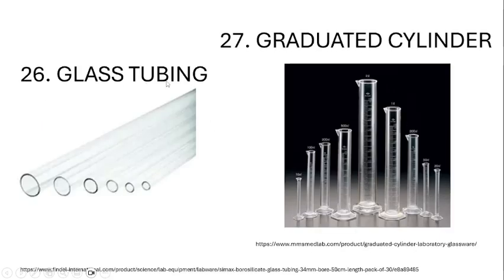Next is your glass tubing. So this is actually a long tube, but it can be cut in pieces or in segments according to usage. Usually, the ones who use the glass tubing the most are pharmacy students. So they have an experiment in the lab which is glass bending or glass manipulation, if I recall correctly. But we can still find glass tubing attached in different setups in our laboratory. So one of which will be the distillation setup.